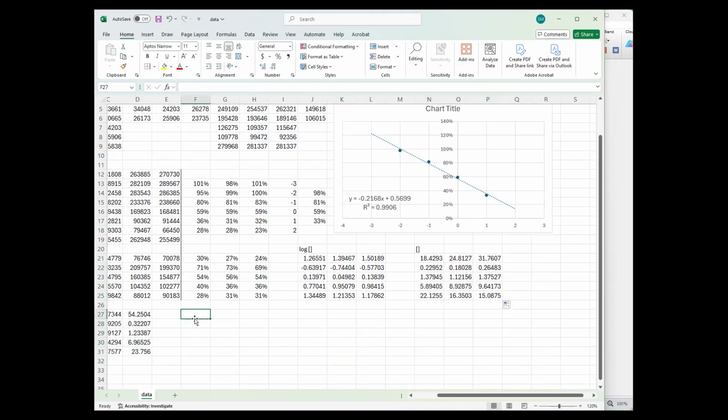I'm going to take the average of these manual calculations, and you can see where some are very close, right? 1.29 is very close to 1.23, and that's because sample 3 here is within our linear range of our standard curve, right? 0.32, 0.22, those are pretty close, but you're getting a little higher, so those in the midpoint are always going to be more accurate, and that's why I say you probably want to put a couple of points around here just to get that curve, but that's pretty close to 54 to 25.